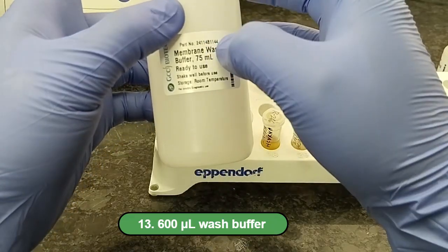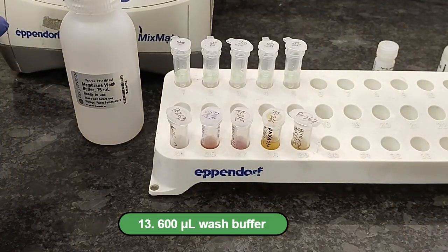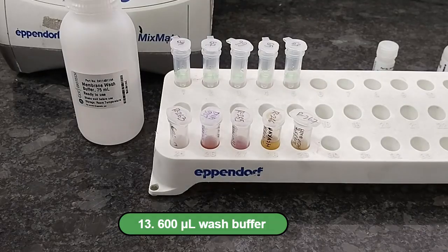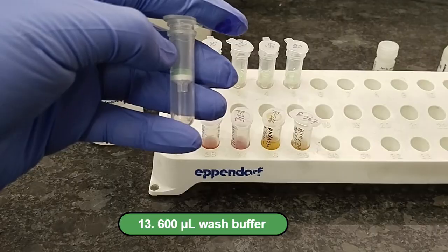Ethanol is added to the membrane wash buffer, and now we have to add 600 microliter membrane wash buffer to each binding column. This membrane wash buffer helps purification of the RNA, as it removes the unnecessary protein and other things that may be in the column.